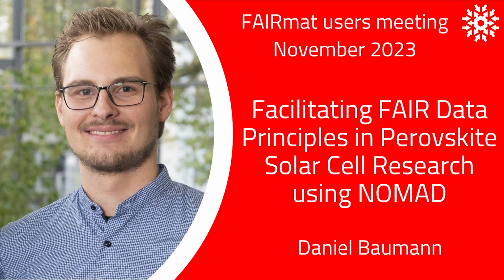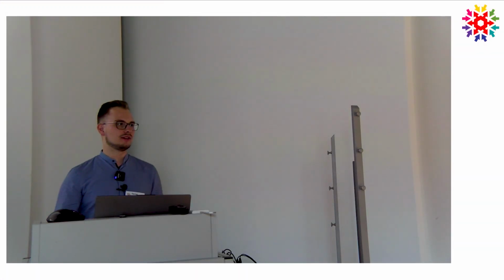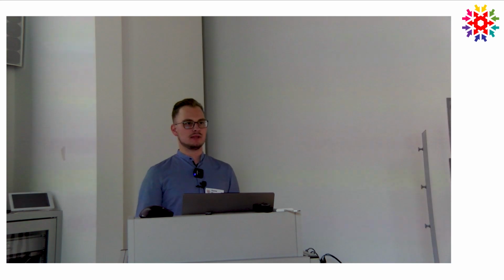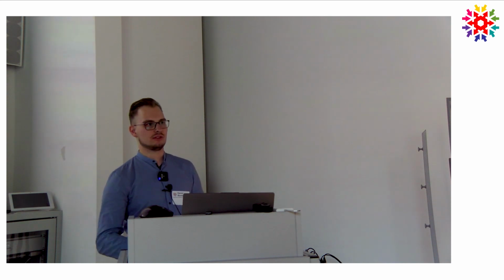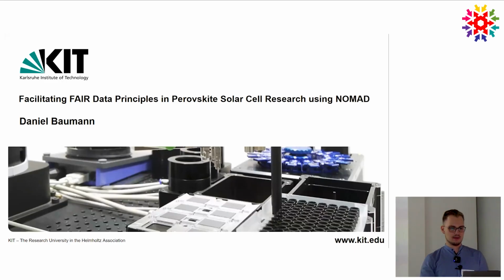Okay, thank you. I will be talking about how to facilitate FAIR data principles in perovskite solar cell research using NOMAD. My main goal is to convince some of the people who are not using NOMAD right now how easy it can be as a user to use the system to plan experiments and evaluate data. For this, in the middle of the talk, we will have a small live demonstration. But maybe let's get into the motivation first.